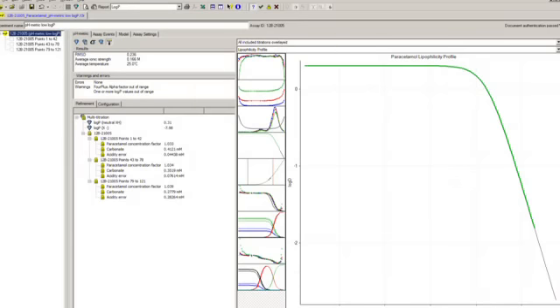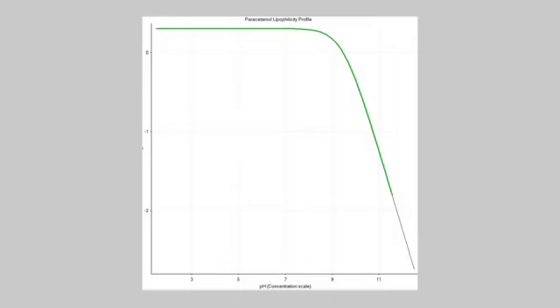The instrument makes measurements and the software determines log P from the data. A previously measured pKa value is used in the calculation. The software produces a lipophilicity profile, which shows how the tendency for the compound to dissolve in fat rather than water changes with pH.